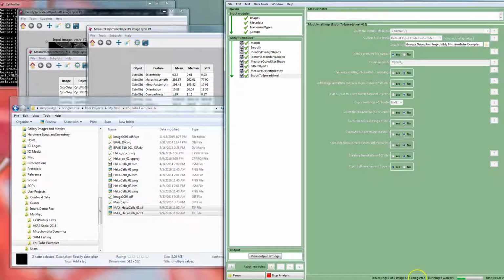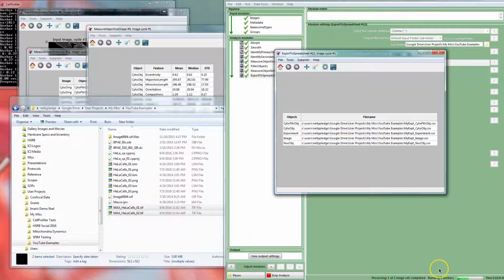It's going to be running a multiple of how many cores, how many threads you've got running. Sometimes you have multiple threads on your machine. You'll see it running like 8 at a time, for example, and it may just show you the first one of each 8 and then show you the number 9, and then it'll go through and show you the next one. And so you don't always see every image as it goes through.